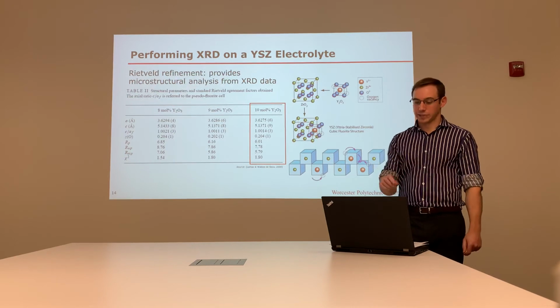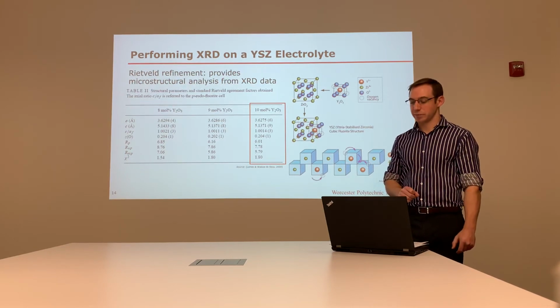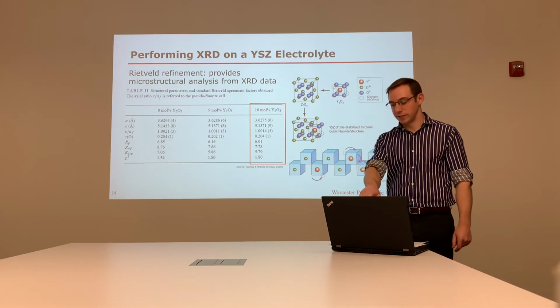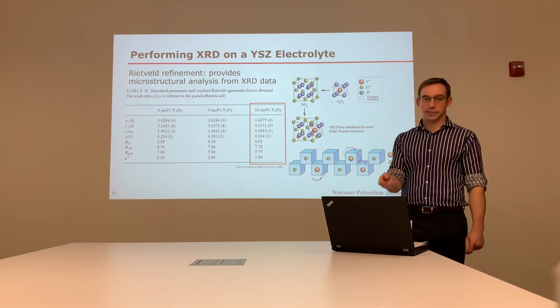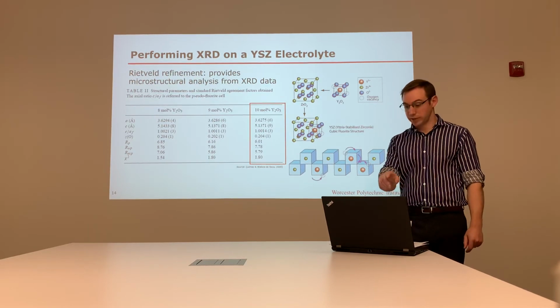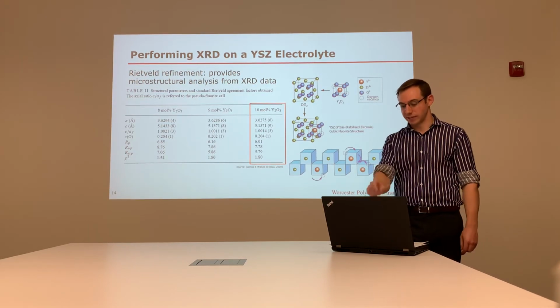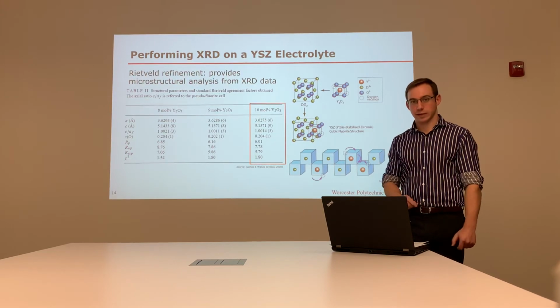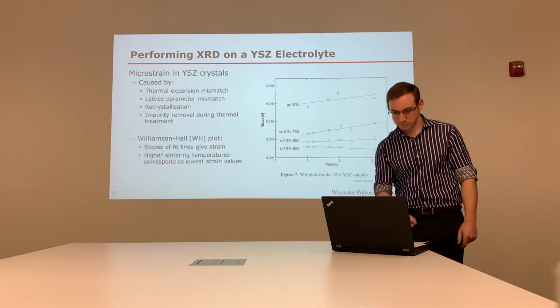The image on the right here shows a cubic structure, but it was included here just to show how selective the yttria stabilized zirconia is to oxygen ion conductivity within the grain. So you can see how the oxygen ions move through that lattice by vacancy transfer.